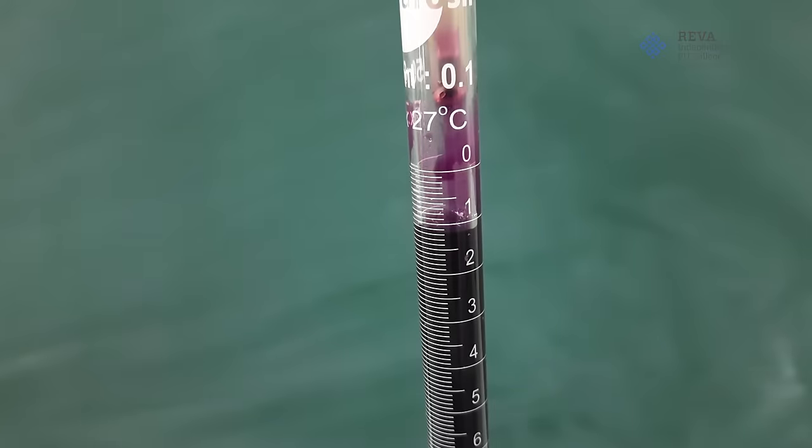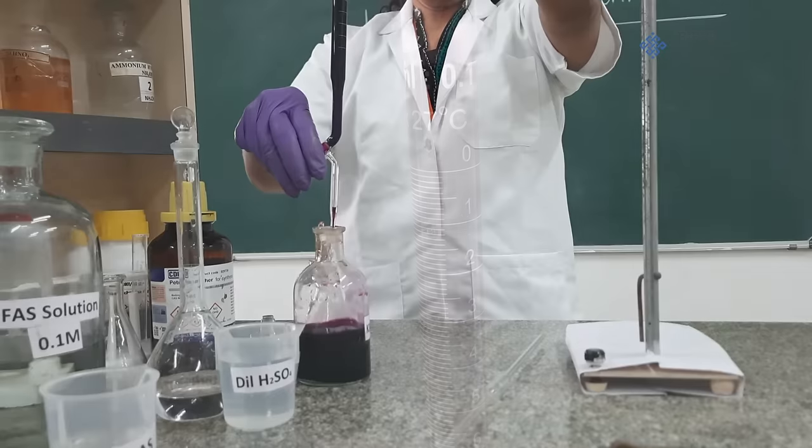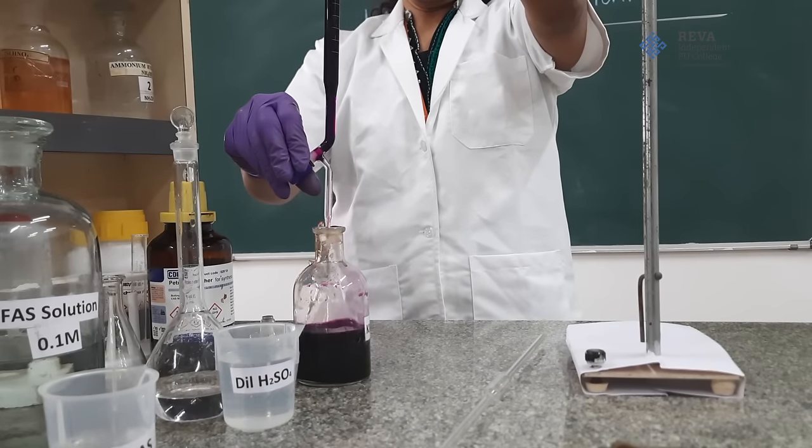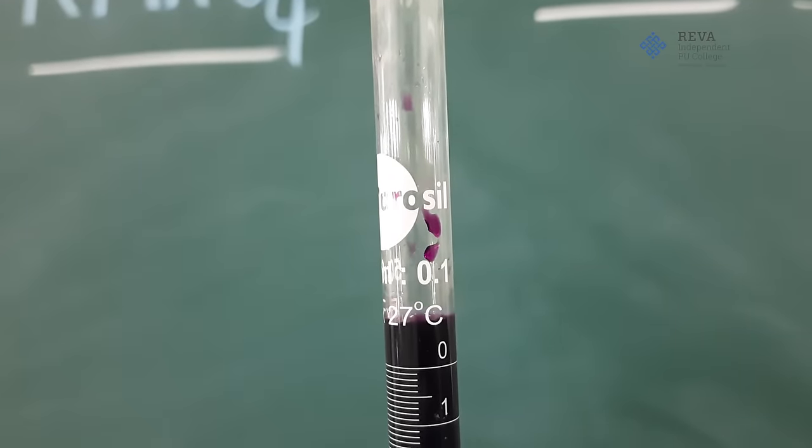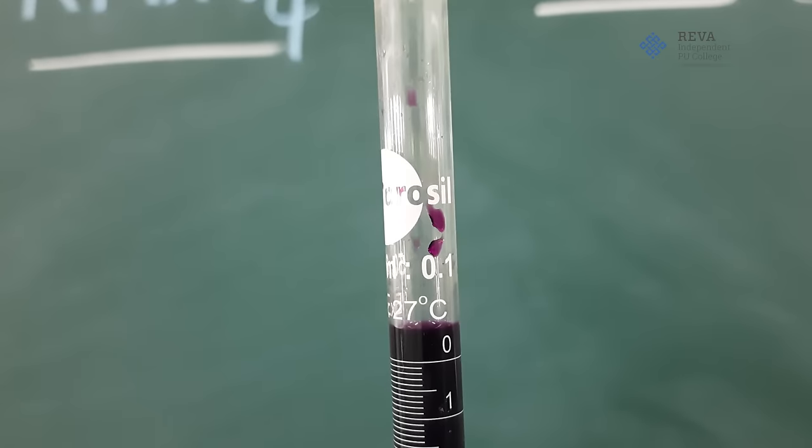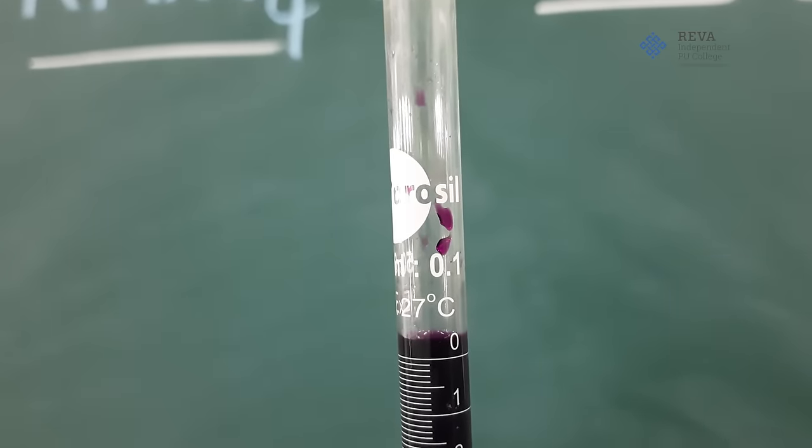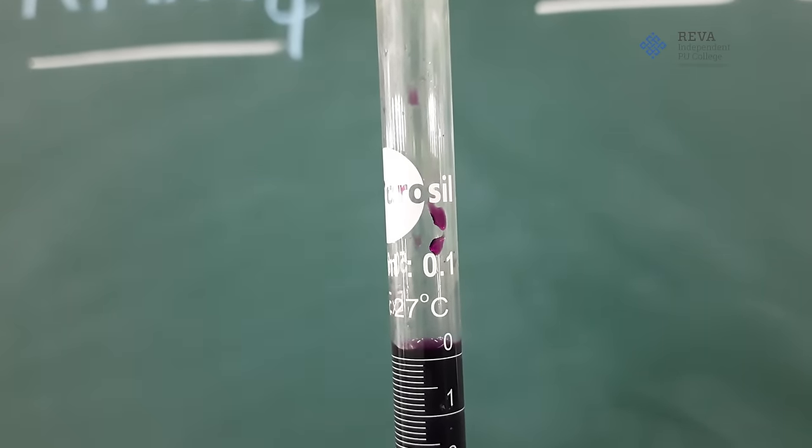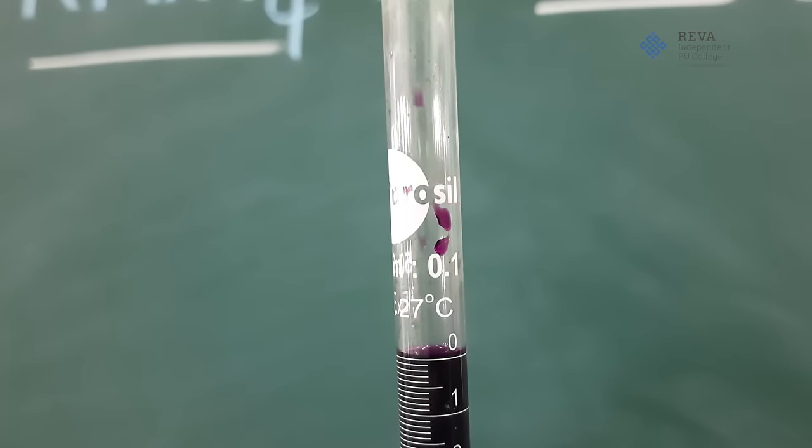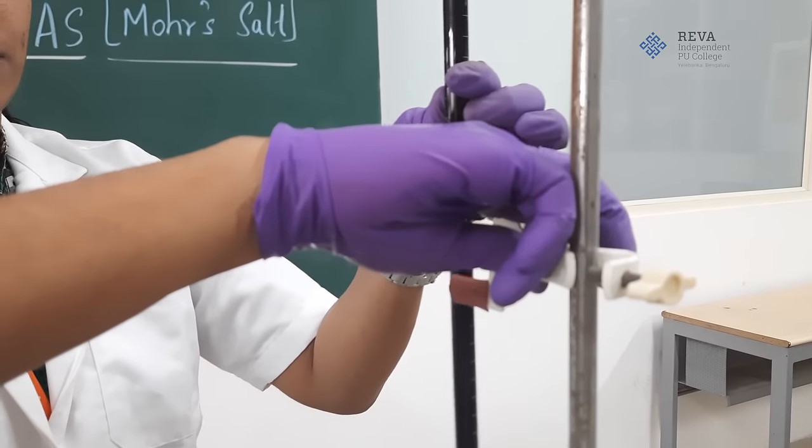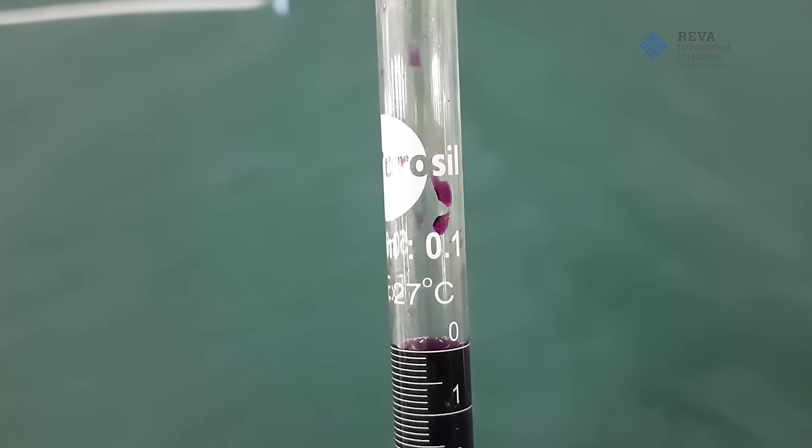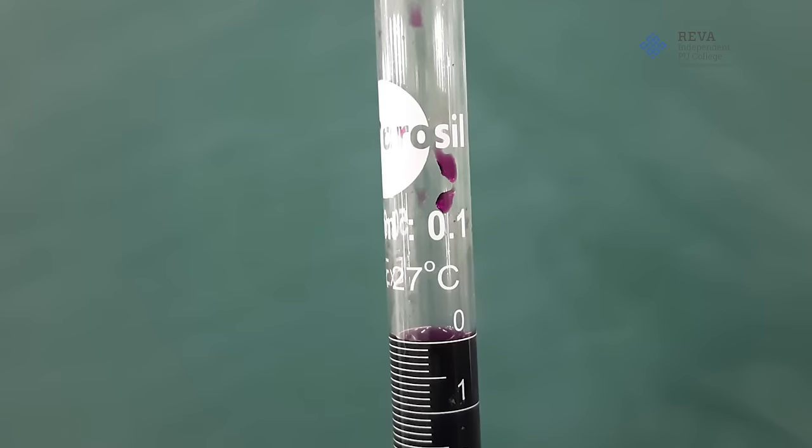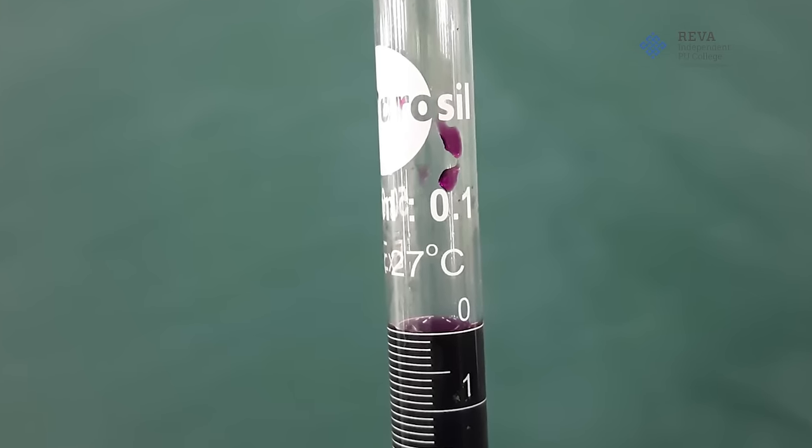fill the burette using potassium permanganate solution, which is an oxidizing agent. Before starting an experiment, we should be careful that the nozzle should be filled. Thus, fill the nozzle and now adjust the solution to zero mark by making upper meniscus of potassium permanganate coincide to zero in the burette and clamp it to the stand. And since potassium permanganate is a colored solution, we should look for upper meniscus.